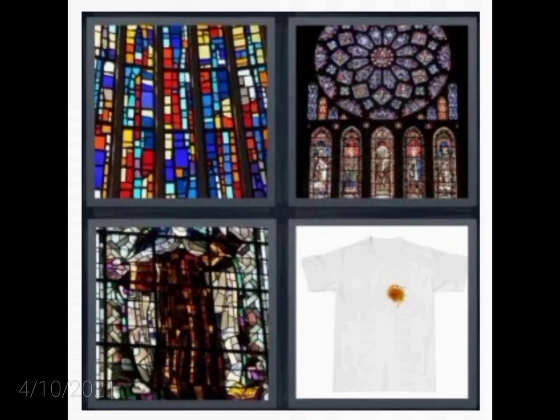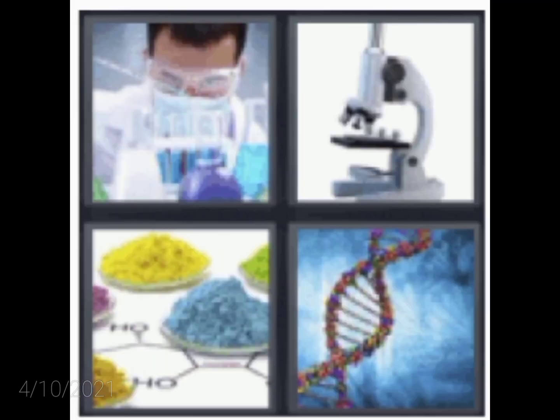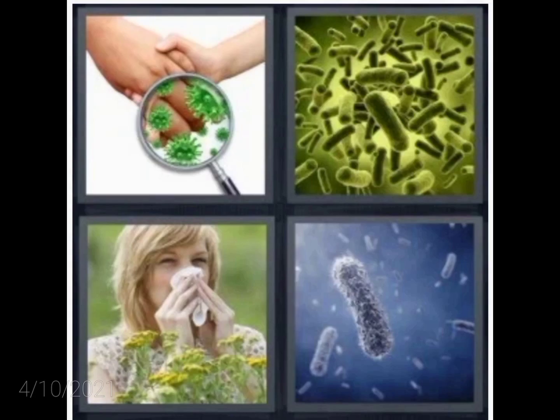Our topic for today is going to be smearing and staining principles and its chronological procedures. To make you well aware of some terminologies, we are going to play a game called 4 Pictures 1 Word. Ready? Are you done? Have you guessed all the words correctly? If so, then let's continue to discuss and learn our lesson.